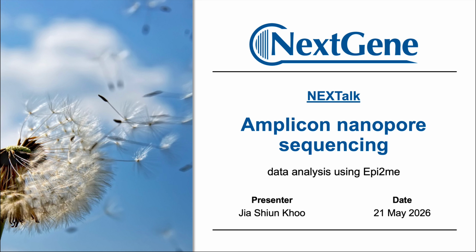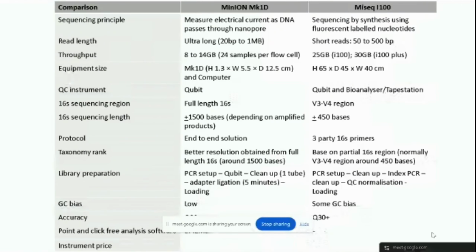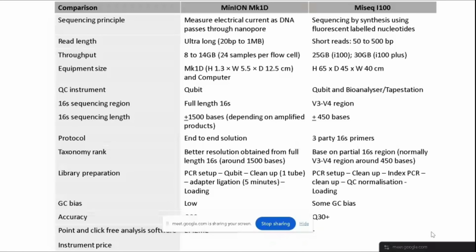Minty, yes? I would take one or two minutes because just now there was a question about the difference between the nanopore sequencer and Illumina. Oh, yes, you can further elaborate and explain to our participants. Okay, do you see my screen? Yes, we can see your screen. Okay, I'm just doing a simple comparison that I have over here.